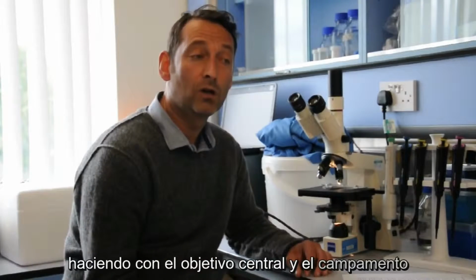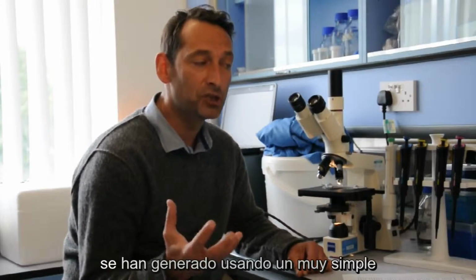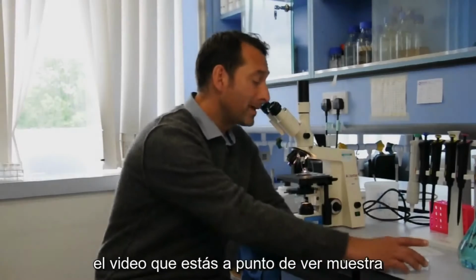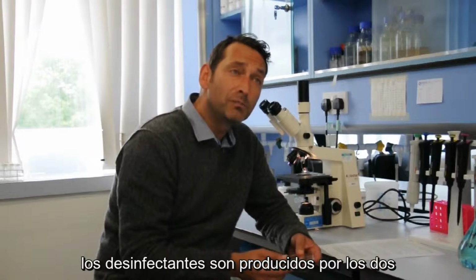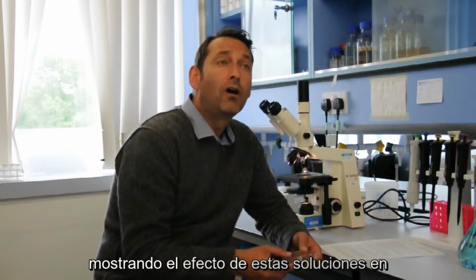And the work we've been doing with Toucan Eco and the Toucan system is testing the solutions that have been generated using a very simple electrochemical cell, salt and water, so we've got a very simple means of producing disinfectant, and testing how these solutions interact with bacteria. The video you're about to see shows disinfectants that are produced by the Toucan system. These are called electrochemically activated solutions, and it's showing the effect of these solutions on living bacteria.